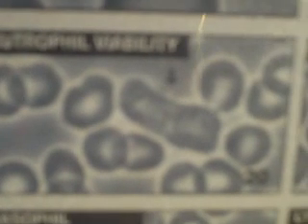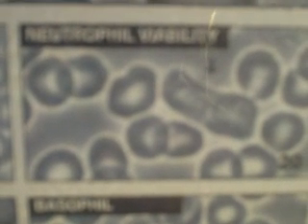Four indicates that, no matter what else is going on in the body, it has not degenerated to any point that would cause these hypersegmented neutrophils to increase to five or reduce to three. Here we have neutrophil viability. Basically this is a picture of a neutrophil, and the viability refers to the movement and the granular activity that you will see in the center of them. And with the neutrophils, you'll notice that they stream. Like the movie The Blob, they just go in the path of least resistance.